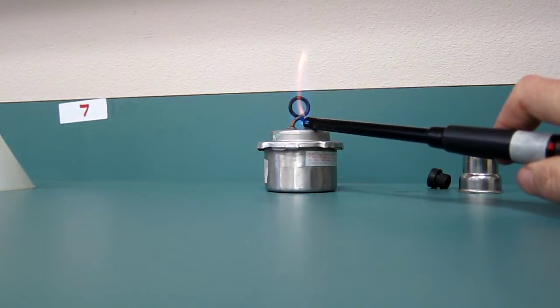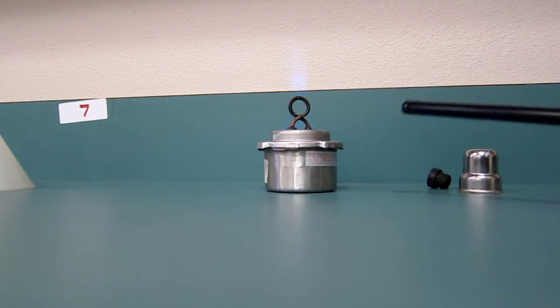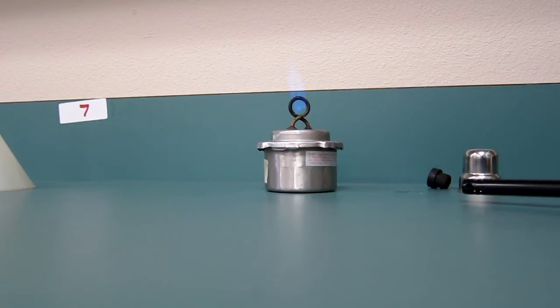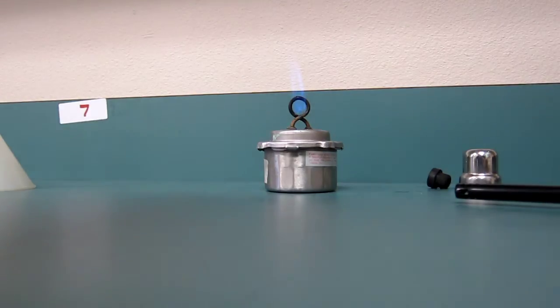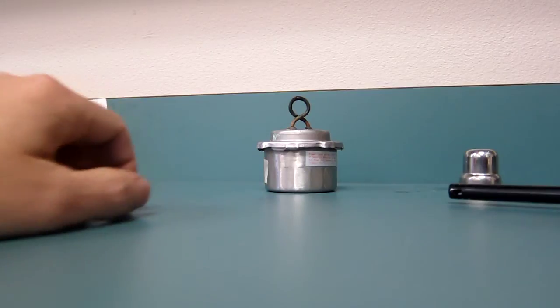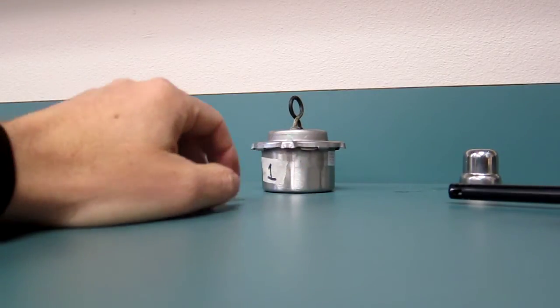Some of them light better from a little lower. Some of them light better from a little higher. Okay, it's burning from the bottom again, but I'm gonna let it, there. Now it's got a great flame, okay? When you're done, you just blow it out. Okay, and you might want to let it cool off before you do anything. Usually takes about 30 seconds to a minute to cool off.